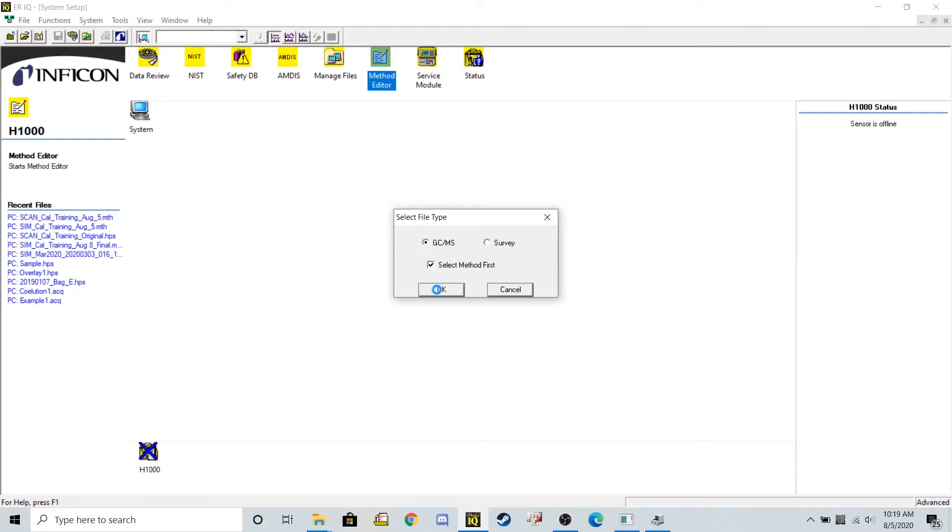In this method, I made a 0.166 parts per billion method, a 0.5 parts per billion, 1, 5, and 10 parts per billion method. So five different calibration levels stepping up between 0.166 and 10 parts per billion.